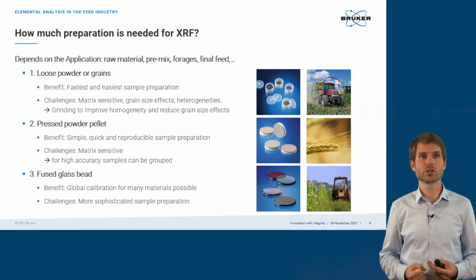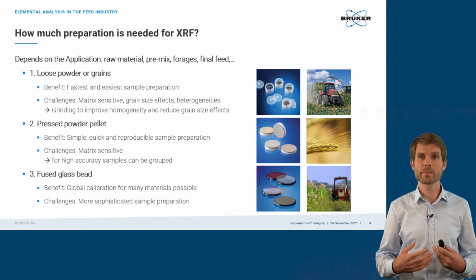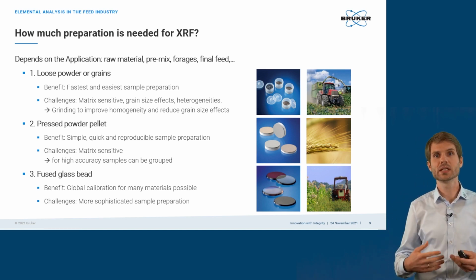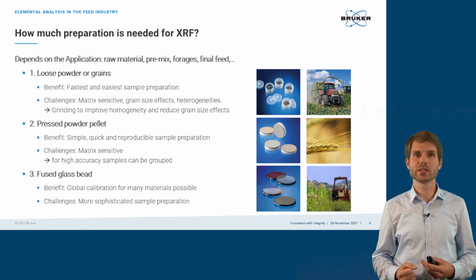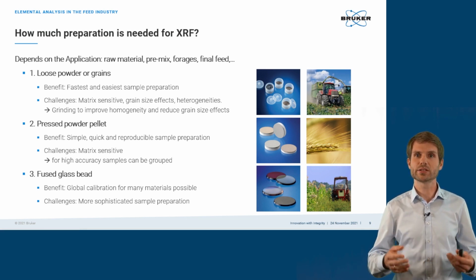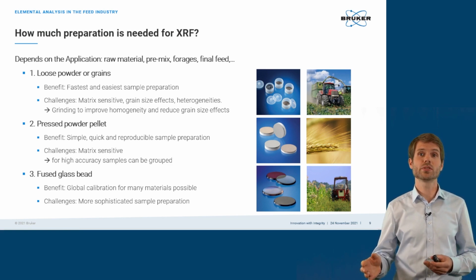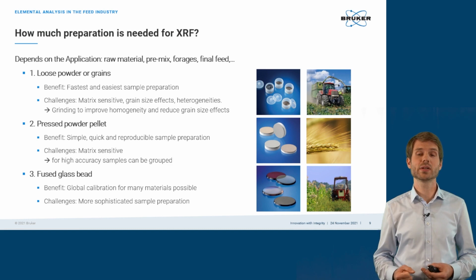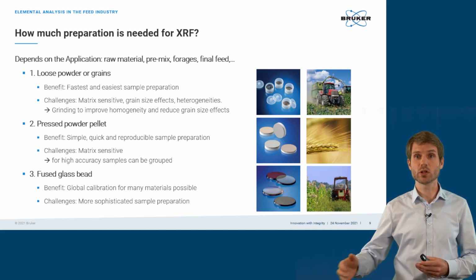These are so-called pellets. These help you to, first of all, have a more homogeneous sample. This is then, of course, more reproducible, with more reliable data quality and also better accuracy. Here, this is typically a good solution for feed. I take this in advance. It also allows you to cover traces and major elements in one set.